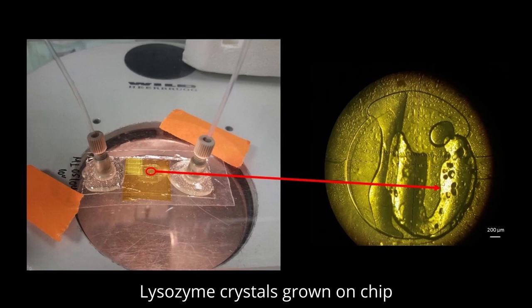On-chip crystallization also eliminates the manual harvesting of the fragile protein crystals, frequently applied in combination with cryocooling during conventional crystallography experiments.